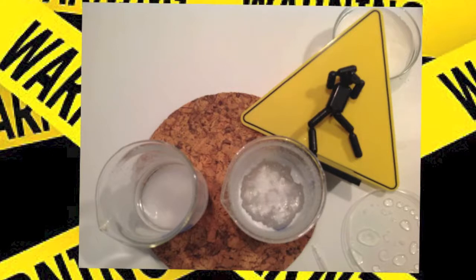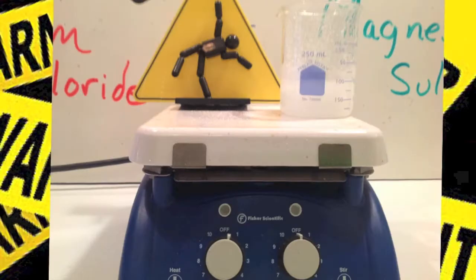Some warnings. This is not a lab that you can take lightly. You have to wear goggles. We're working with hot salt solutions. We don't want that in your eyes. Things will be very hot. We'll have boiling salt solutions.